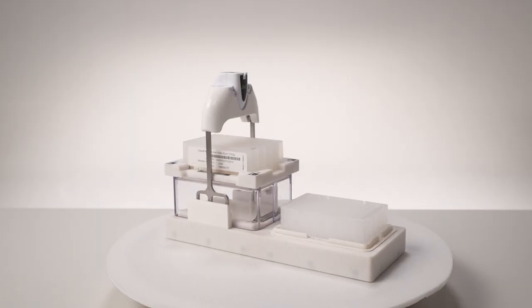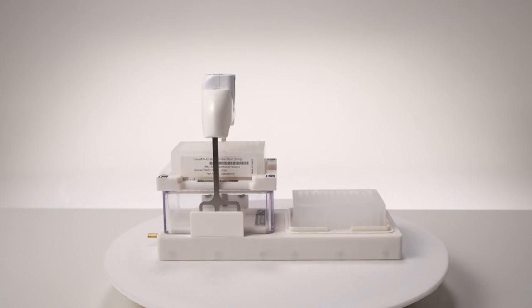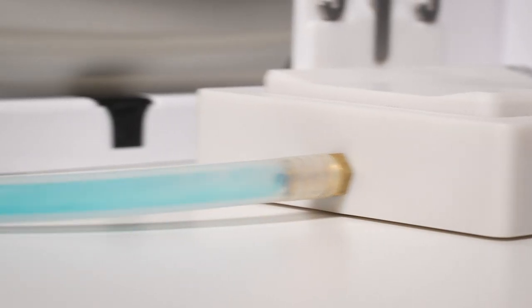Next, there is the machine-readable manifold device itself. This is the part that sits in front of the Andrew Plus robot, just like a domino, and is important for full automation. Here's how it works: the base of Extraction Plus enables continuous waste flow through towards a collection bottle.